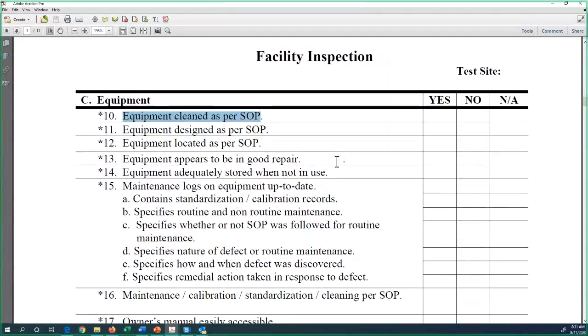How about the centrifuge? Now it's getting trickier, because if it's a bigger one, you probably want to have it, and it's temperature controlled, for example. How about a tiny small one? How about a vortex? How about a shaker? It's your decision and your scientific judgment which one is the major one and which one is the minor one. If it is a small shaker or vortex, I typically don't put it there. There's no need to have an SOP, unless this vortex speed really affects your work. Then that's different. That's like a shaker.